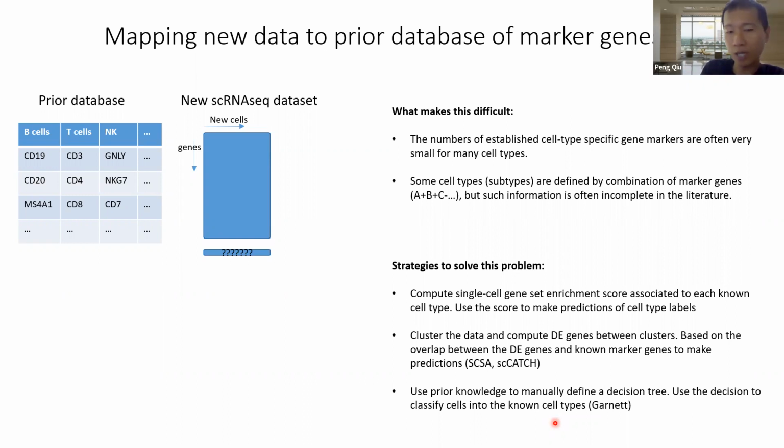Because, for example, if you think about flow cytometry data analysis, right? What people usually do is they use known markers, for example, CD3, CD14, CD19, those known markers for major lineages, and then use those markers to draw gates or make decisions of whether cells belong to, say, the lymphoid lineage or the myeloid lineage or the B or T lineage.